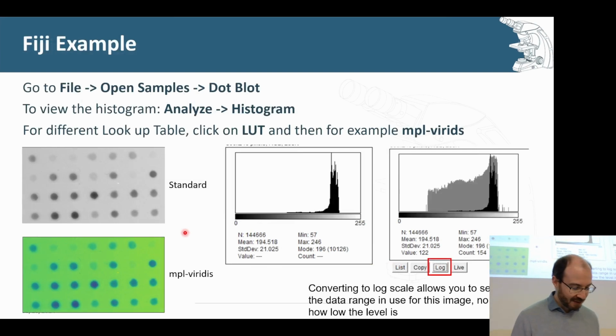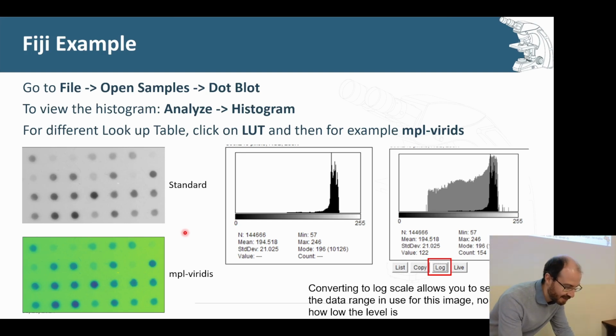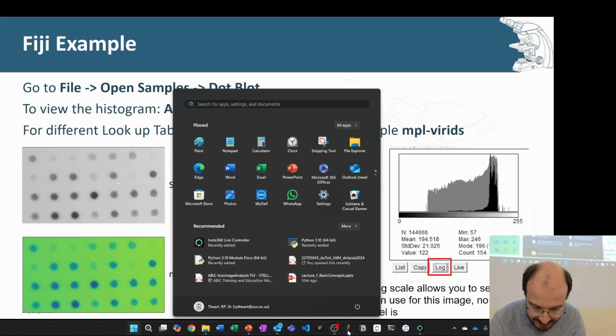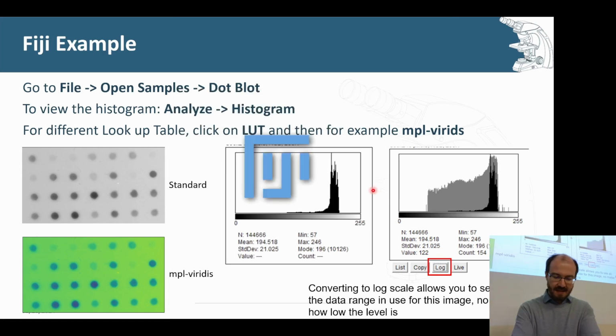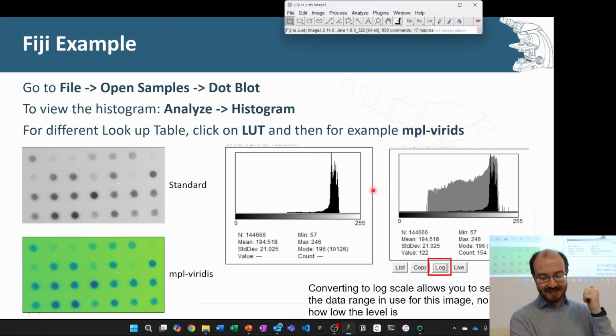Okay, so I think it would be good to quickly do an example, and this is where you come in. Every now and again I'm going to stop and ask you to open up an image. For now you can just open up Fiji. For the most part, the instructions for what I'm going to demo and what I would like you to do you'll see on the screen in the slides, but there might be some things that I quickly show that aren't in the slides.